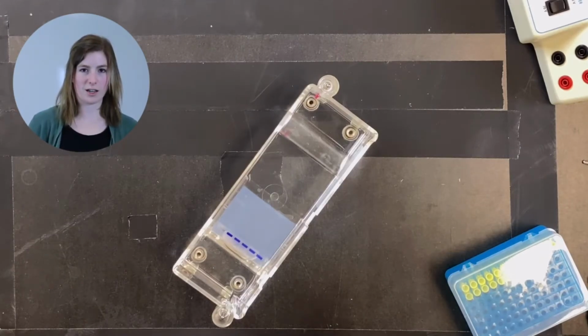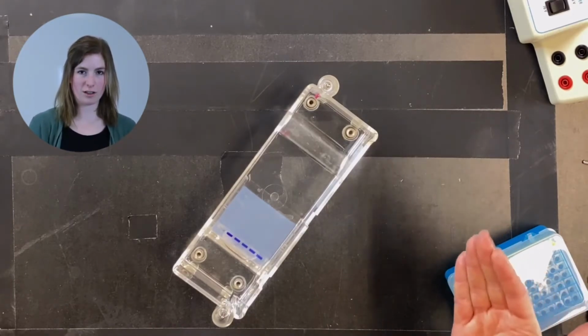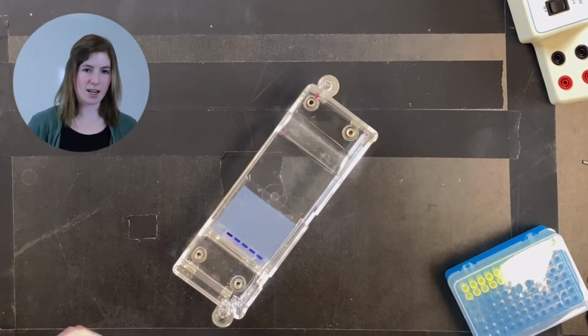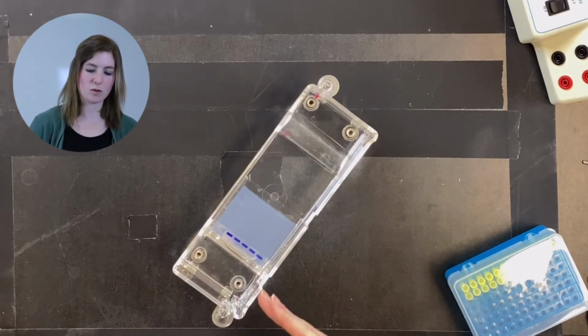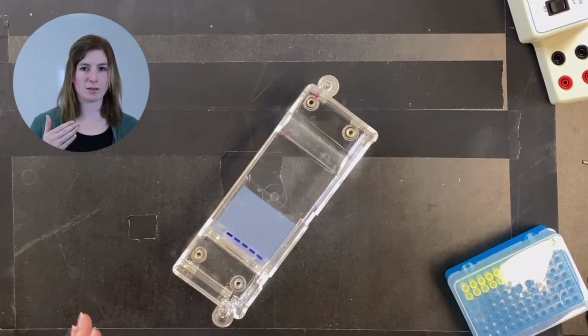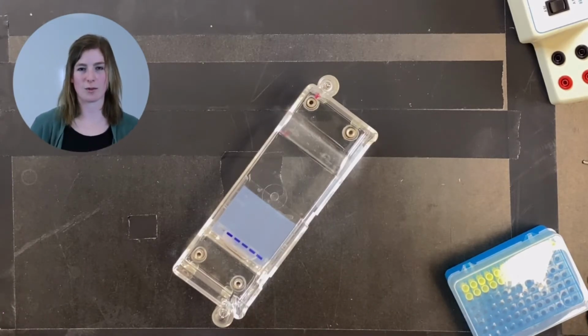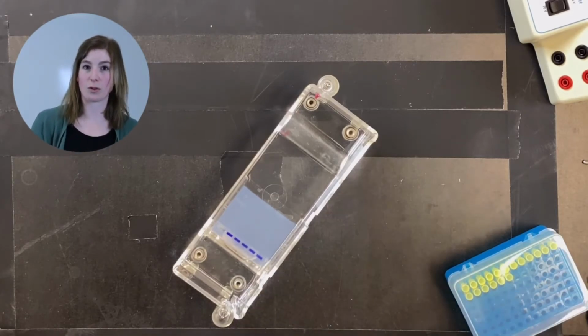So you can actually see when you're looking at it that in each of the wells, it looks like there is all of this kind of purple dye just sitting there. And once I actually turn on the electricity to this, the DNA, which is negatively charged, will start to move towards that red electrode, towards that positive electrode. And what's been done to these samples is they've been cut in specific places. And so you'll have some bands of DNA that are larger and some bands of DNA that are smaller. And the smaller bands of DNA should move quicker through that gel, and they should move further through that gel.